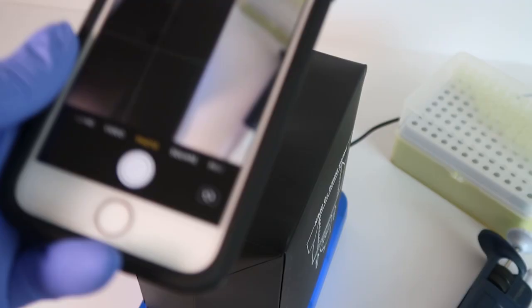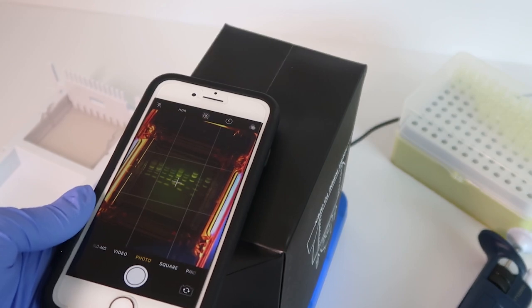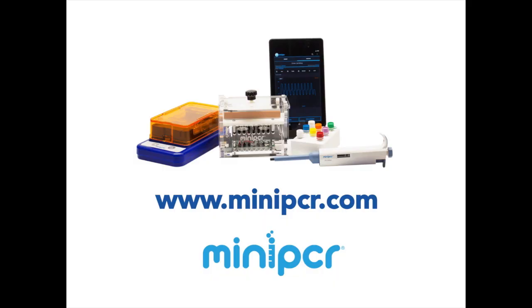Place a smartphone or tablet camera directly on top of the small opening and take a picture. Go to our website at miniPCR.com to learn more about blue gel and other mini PCR products.